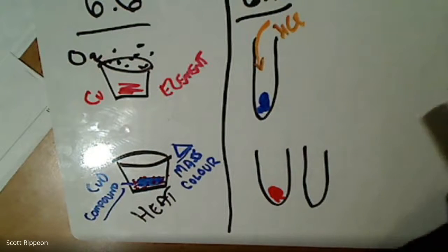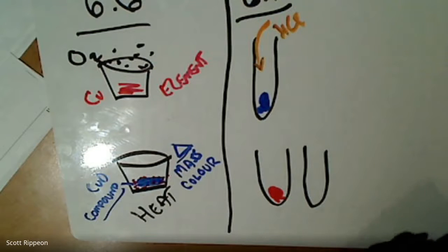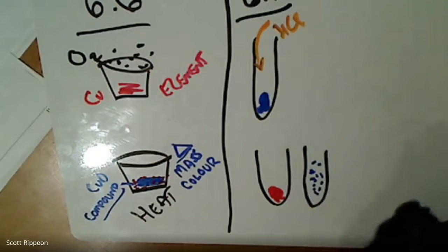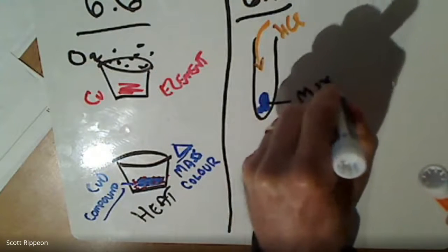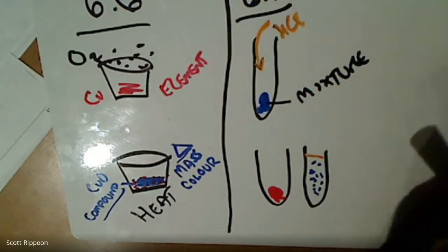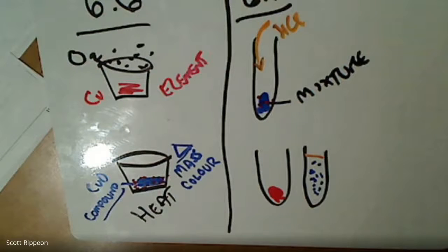One of them was solid copper again, that element, and the other had a dissolved mixture of copper oxide. So no chemistry. All we did in 6.7 was separate the mixture with which we started, and we got it down to the 2 different parts that we had present.